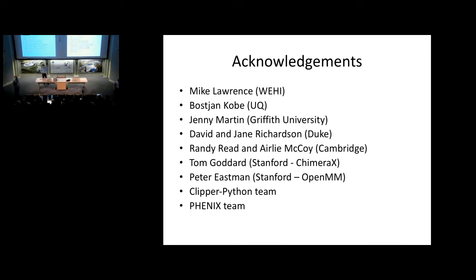Very nice talk. I thought it was interesting that you're trying to do things kind of at the next generation. What about skipping a generation? So one of the interesting technologies that is coming up is virtual reality. I've seen examples where you have some little gloves or whatever, stick a headset on, and you can actually move things using your hands, feeling forces.